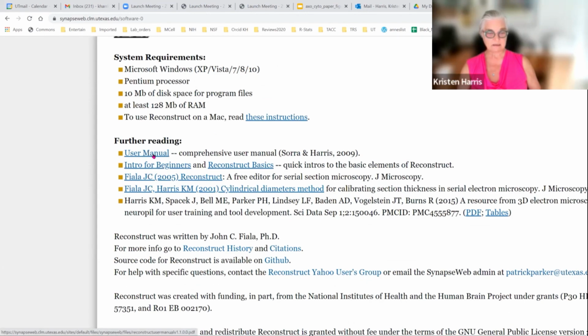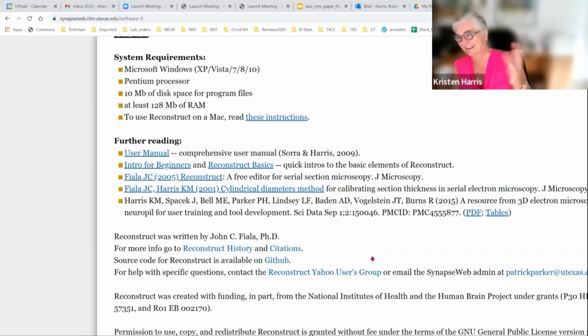Let's see, if you look at the manual, but also I think even in GitHub, it's pretty well documented. The source code is, as I recall, by John. He came from a background of industry code, right? So everything was commented. So hopefully things are mostly obvious. People like Michael Trillo have been able to go into the code now and extract the data from the code and not have to use the interface. So, he's pretty green in programming. So I think it's pretty good.